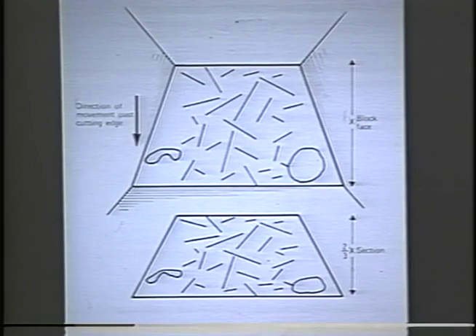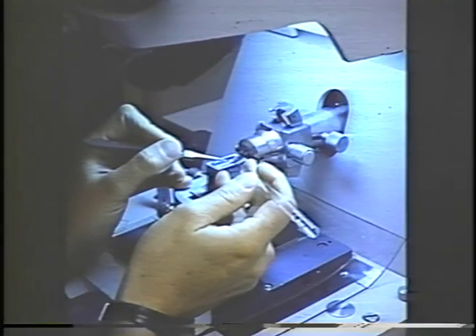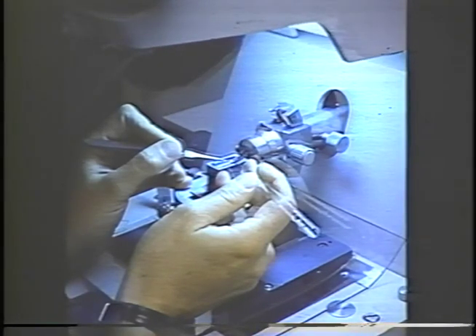For very thick sections, sections thicker than a micrometer, you can just pick the sections up with forceps or a manipulator hair and float it on a drop of water and then heat the drop of water, and that will help the sections to relax and spread. Next slide. The loading of the sections is a kind of an art in itself. I have learned that you can't be a coffee achiever and do this well, so I don't have coffee or anything like that. I try to be relaxed when I'm doing this. Next slide.